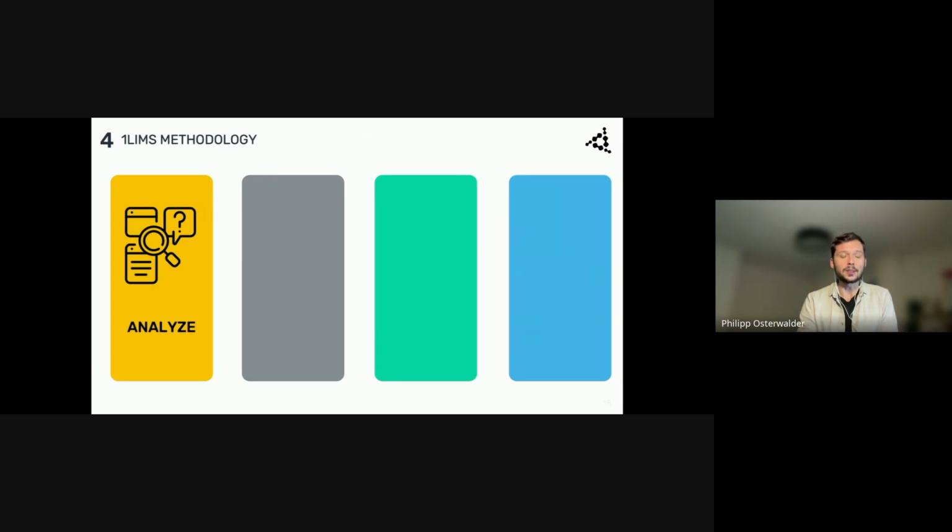We do it based on Lean Six Sigma tools like multi-moment analysis or the process map based on value stream mapping and SIPOC. And then we evaluate the bottlenecks and create an action plan, an implementation plan, together with clients to define a roadmap and a timeline. This is our fundamental stage. This is where the success of the digitalization project and also the LIMS implementation starts.